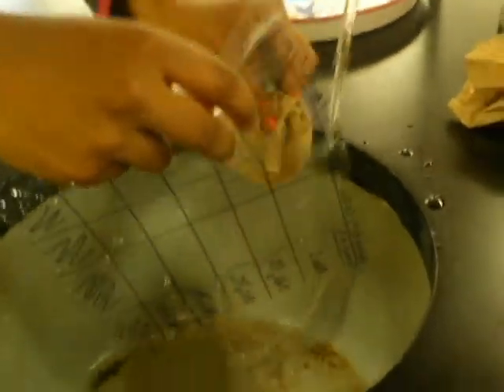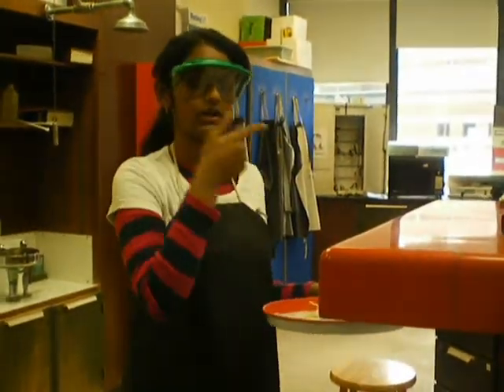You're going to walk from there to here, and the hot plate. And then just wipe it off with another clean paper towel. Now with all these pipettes, we just go to the disposable garbage can.